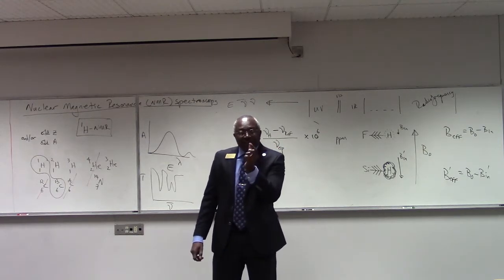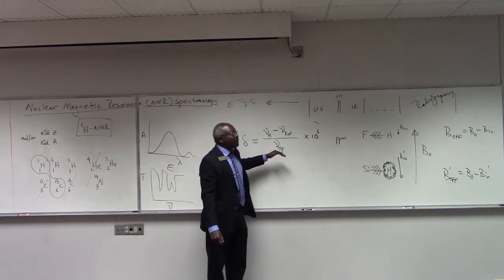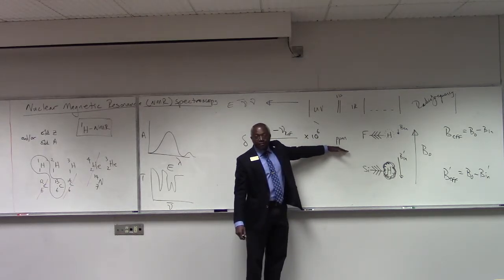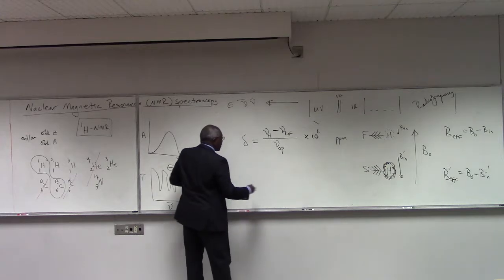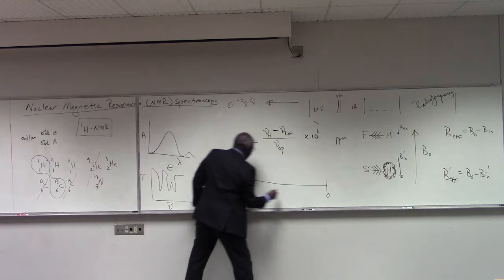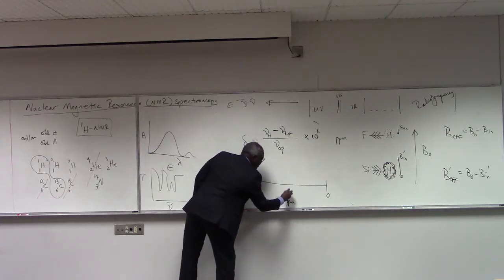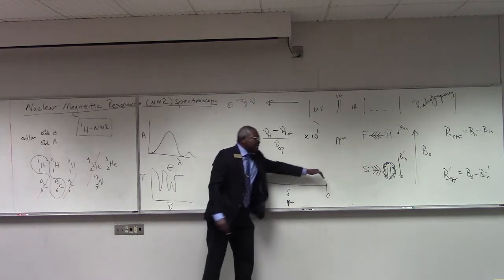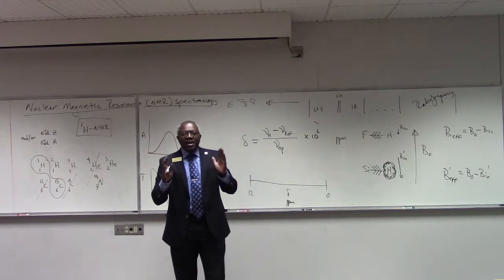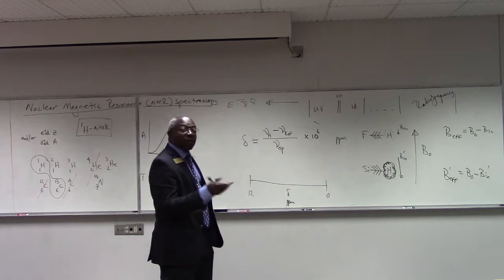We take that difference, we divide it by whatever the operating frequency of the machine is. We multiply that by 1,000,000 to get numbers that are parts per million. And so when I run the NMR of a typical compound, what you'll see is we run it from about 0, typically to about 12, and that's in ppm. So I'll have a delta value that runs from 0 to about 12 ppm. That's a classic range, the classic window, the spectral window for proton NMR.